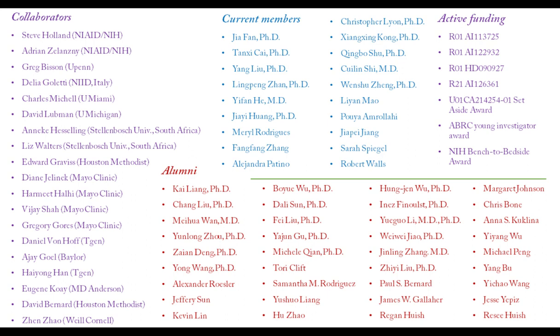What is the advantage of using peptides as biomarkers rather than the whole antigen protein? Well, we did use the whole protein as biomarkers, and we developed ultra-sensitive immunoassays to profile those whole proteins. But we had two problems. One is that those proteins are at ultra-low concentrations in the blood, probably because the secretion rate of those antigens is low.